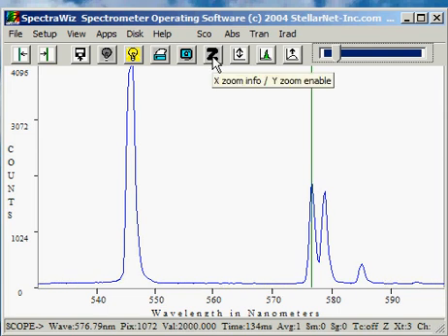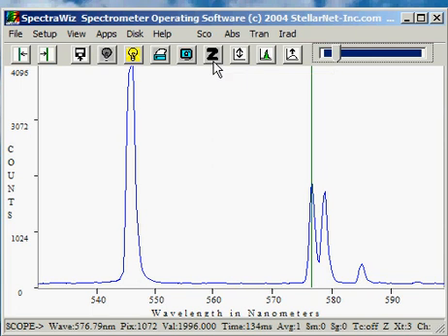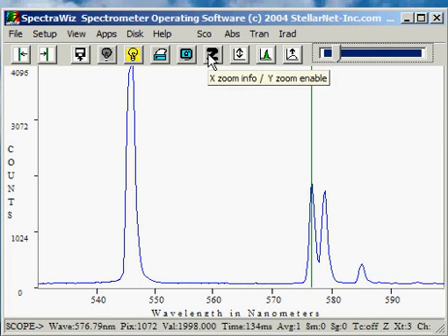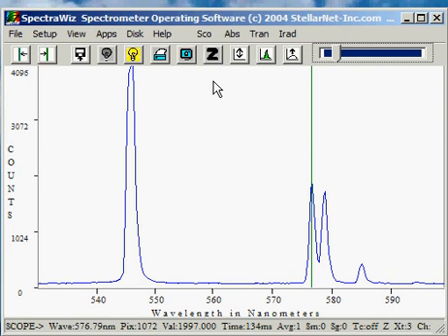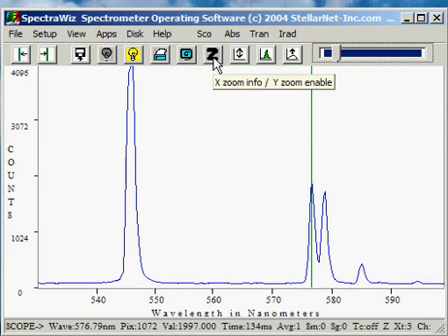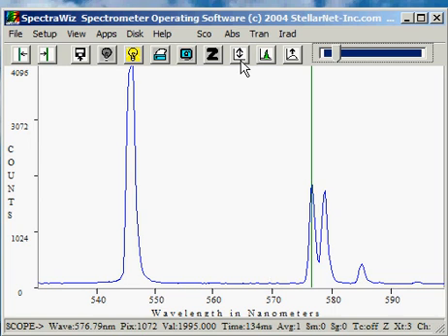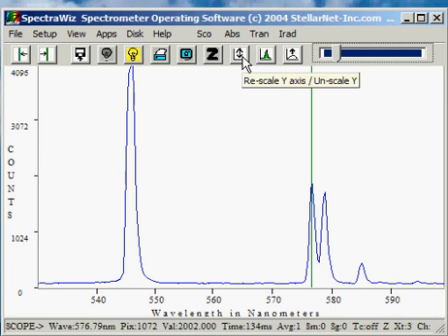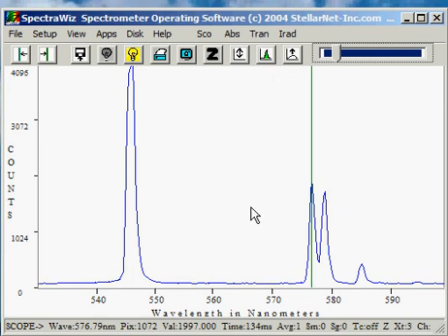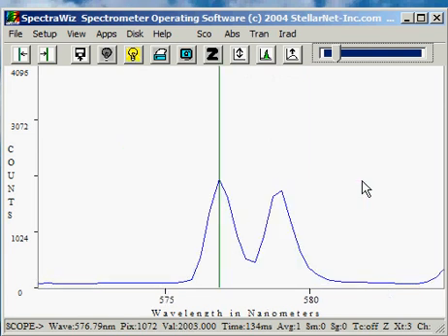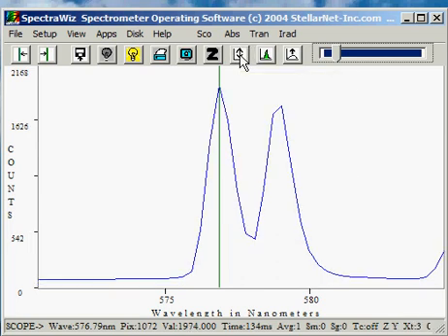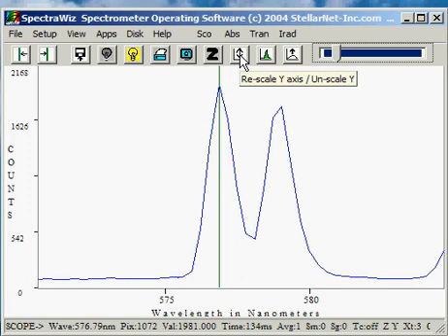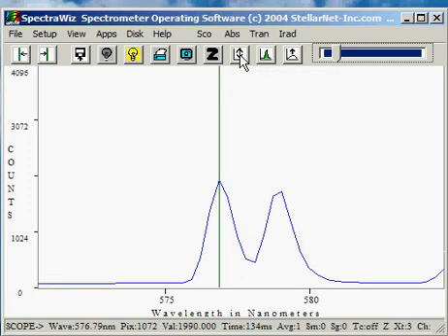The Z icon allows X zooming and XY zooming, and information is provided when you select this icon. The up and down arrow allows you to scale and rescale the Y axis. For example, if I zoom in on the mercury doublet, I can then zoom in on the Y scale by left-clicking. If I right-click, I can un-zoom that.